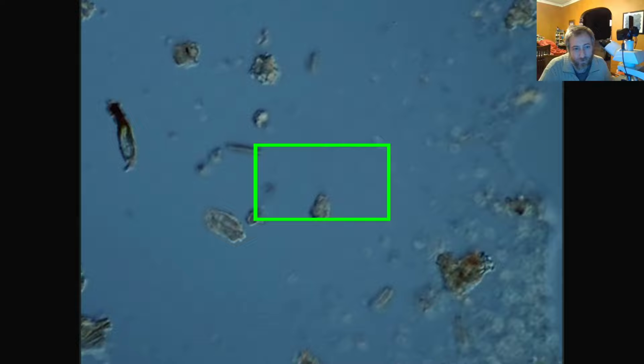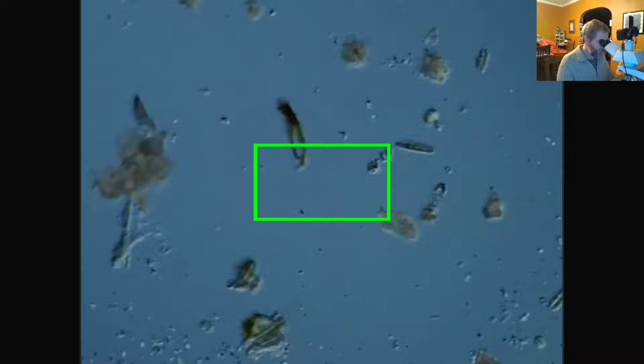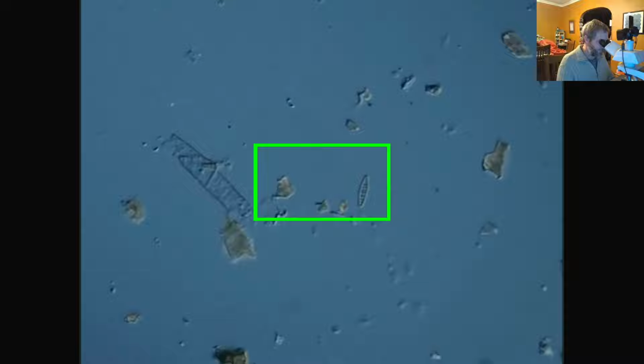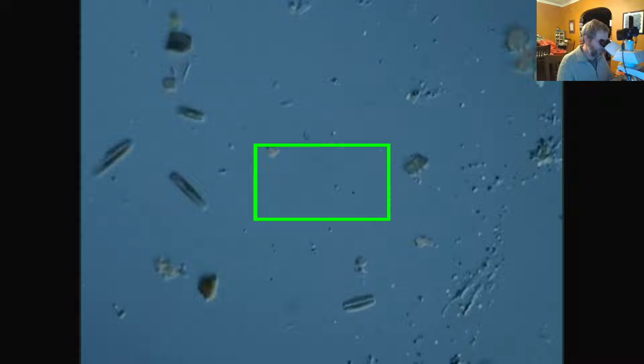There are some diatoms that they find growing in the cooling ponds associated with nuclear power plants, and some of them have these really truly mutant structures. I can't remember off the top of my head the name of that diatom, but it got its own genus because it had structures that nothing else has. It was found living in a nuclear power plant's cooling ponds, outside of the towers.